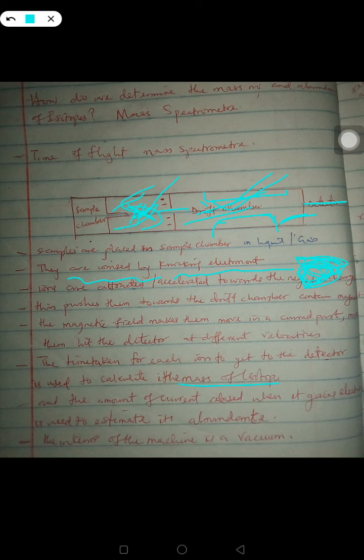That current is what is used to measure its abundance. So that means the higher the current, the higher the abundance. If the current is more, it will have a larger abundance. If the current released is small, then it will have a lower abundance. So those are the key things. This is the summary of it, okay?